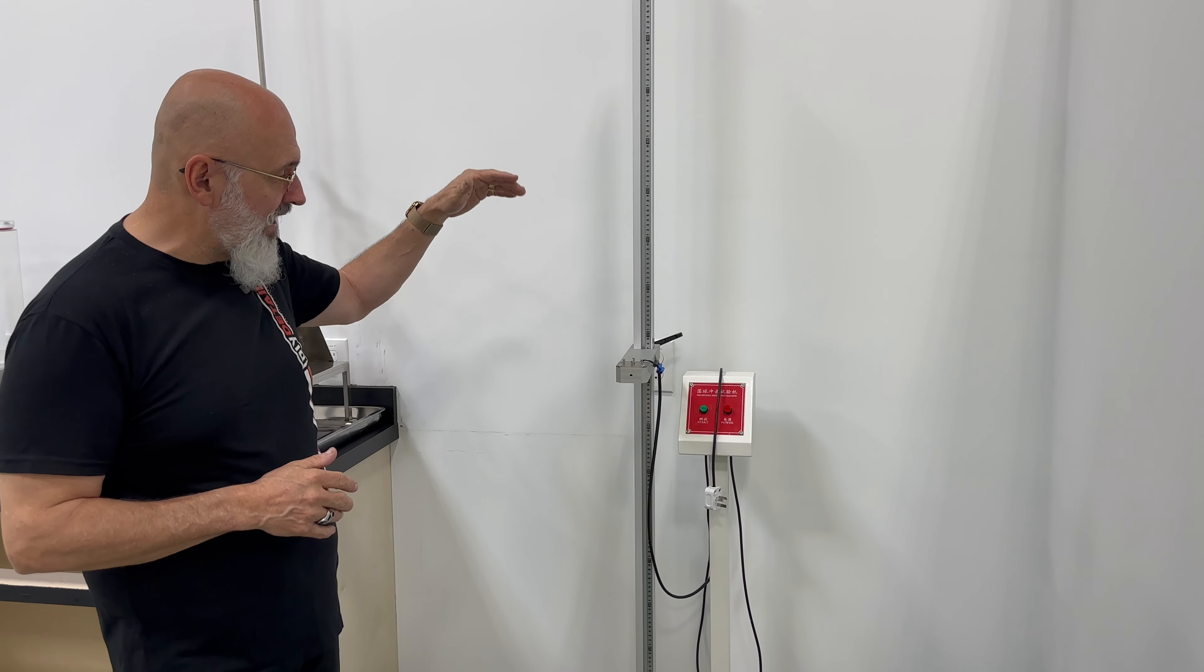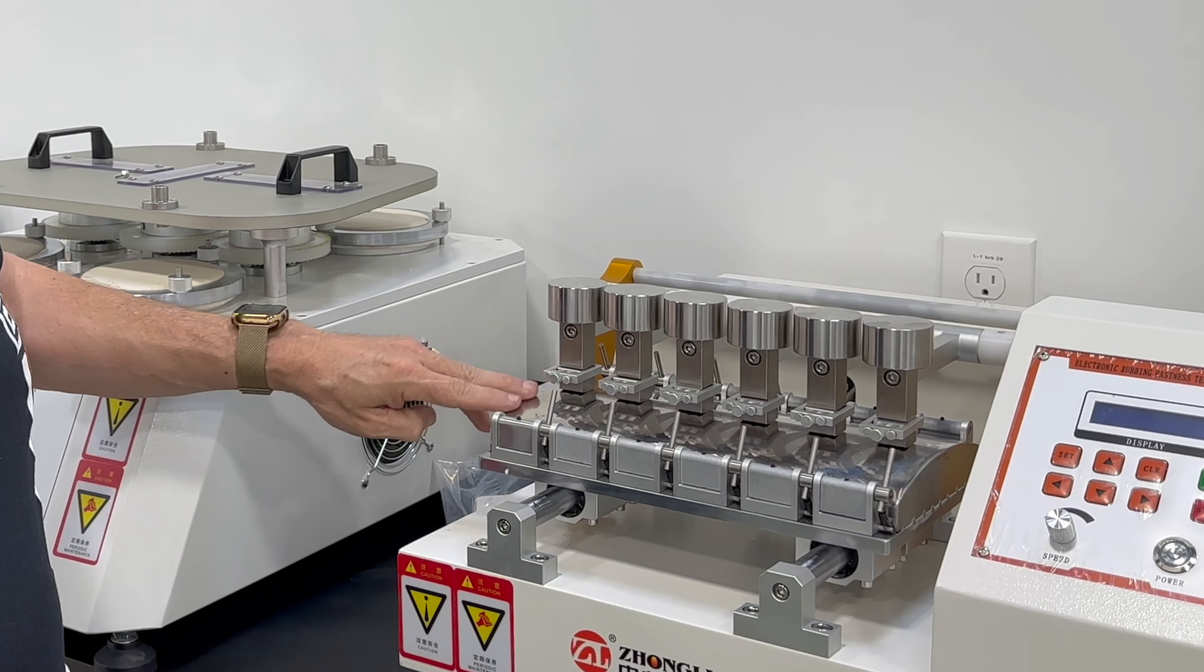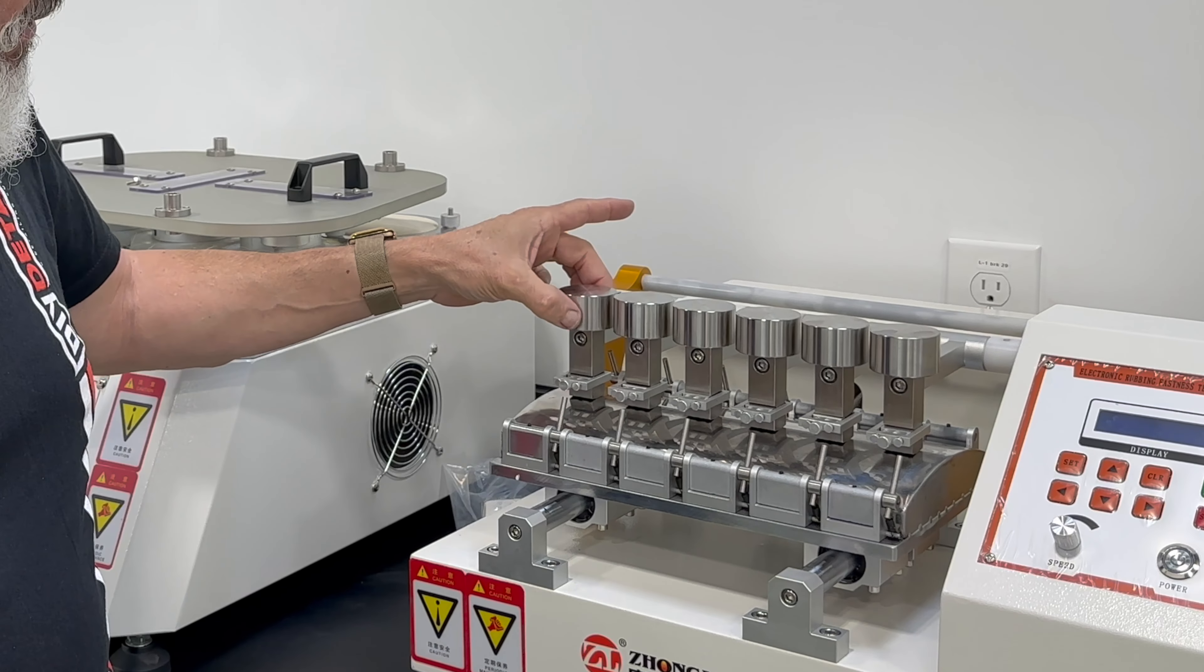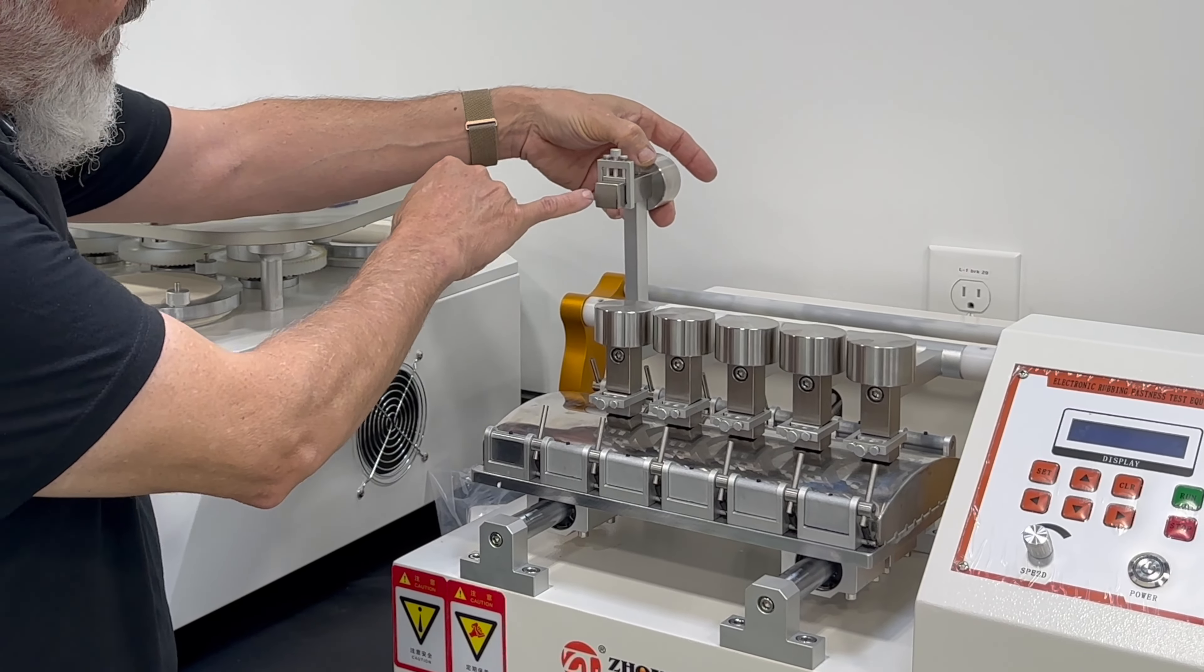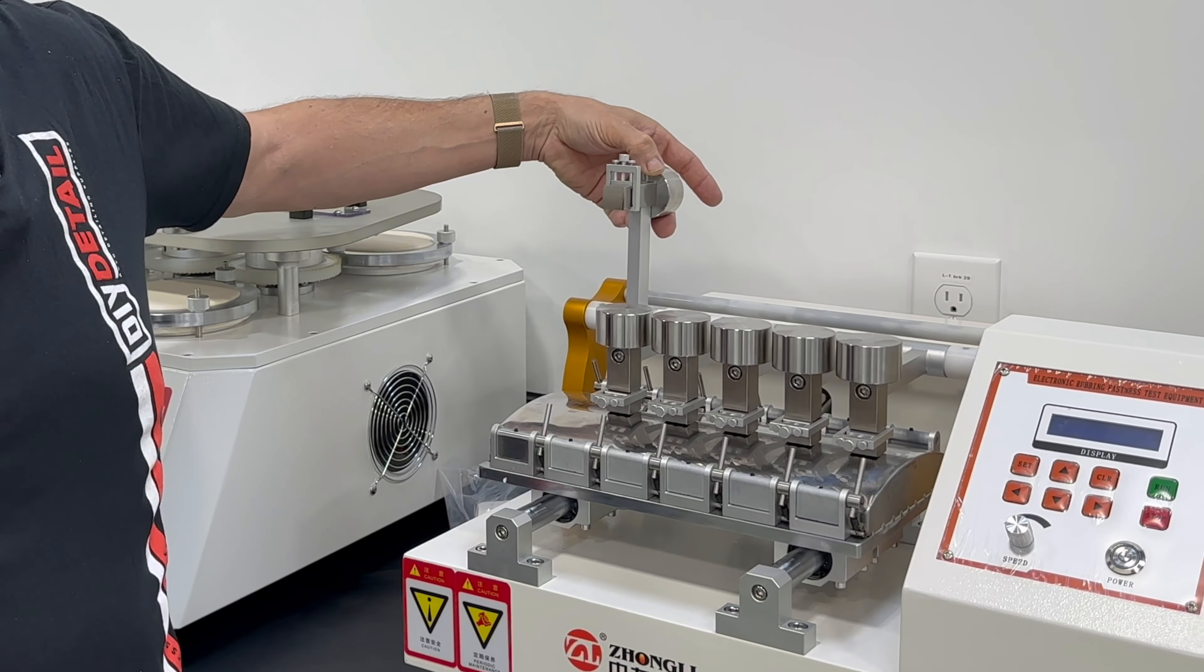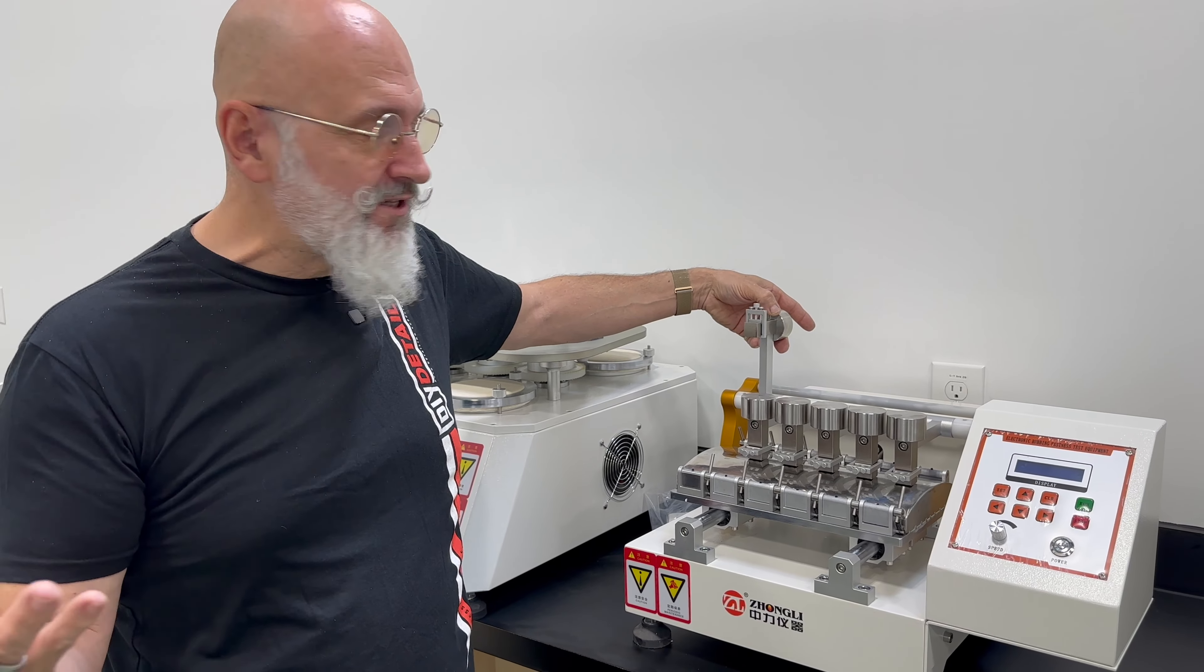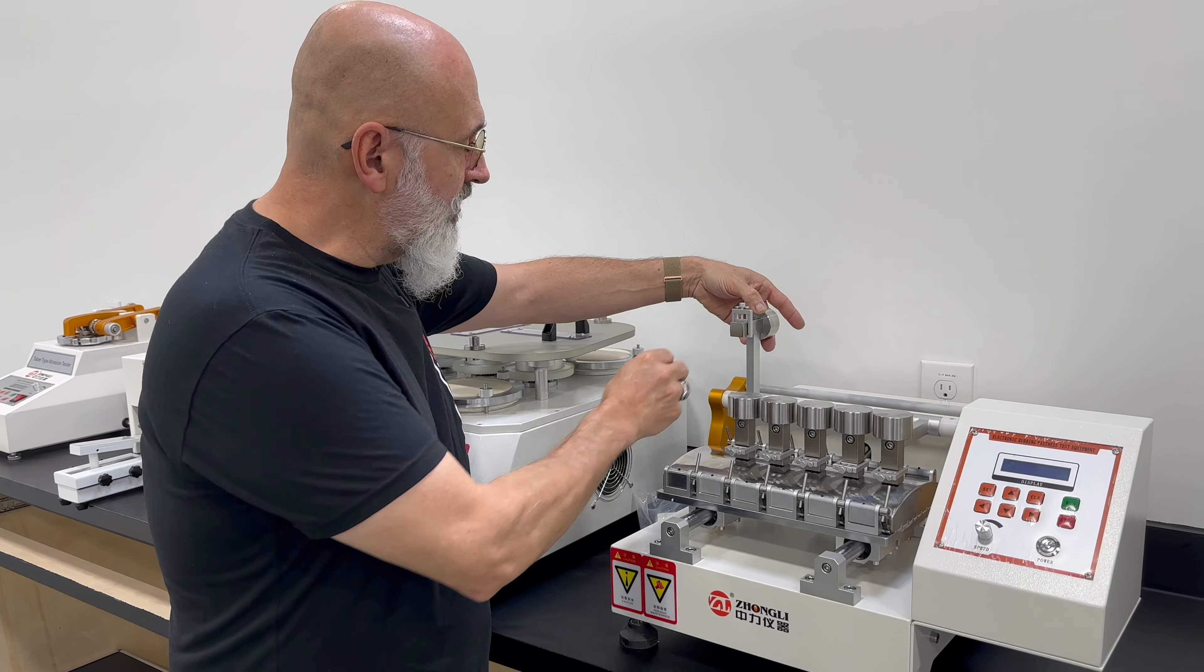This machine, very important for interior coatings. And the way this works is you'll put a piece of leather or whatever fabric you're wanting to test on this platen here. Then in these little holders, you put another piece of, let's say a jean. You want to check for jean transfer, jean dye transfer. You'll put it on here.